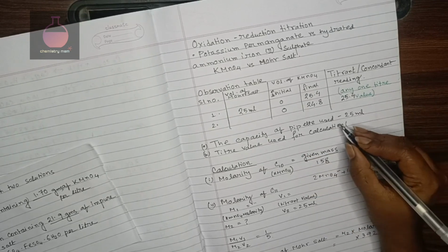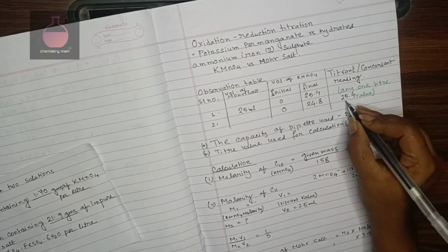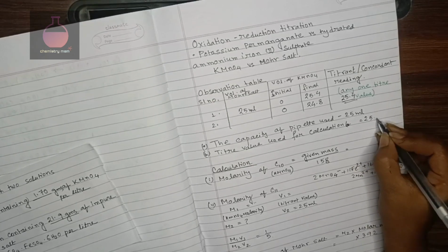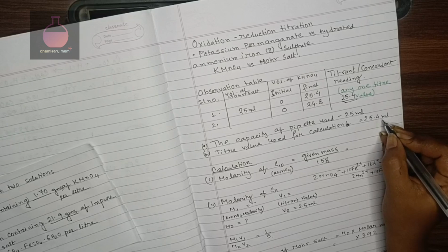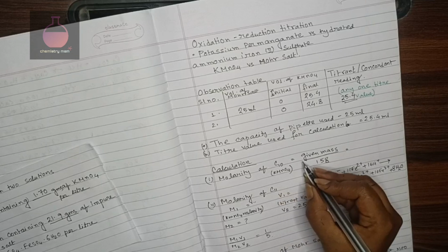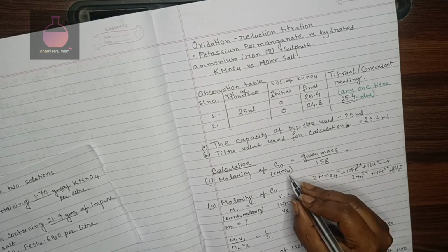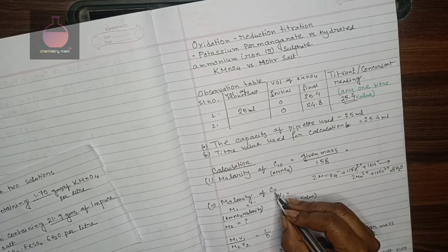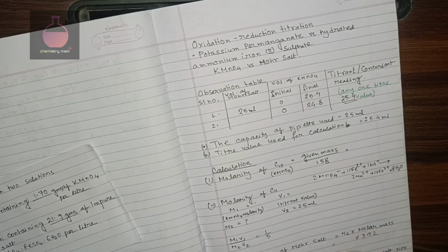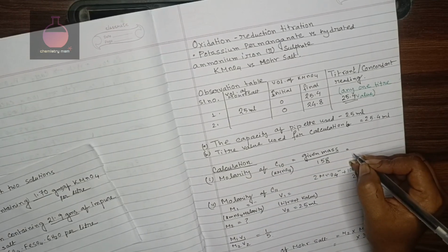After making this observation table, you will write these two lines. First, capacity of pipette used: 25 ml. Then titre value used for your calculation, that will be the value from above. You need to write it down once again here: 25.4 ml, just to make sure that you are using this value. Then the first question is molarity of C10. Second question, molarity of C11. Third question, strength of Mohr salt. Then percentage purity.